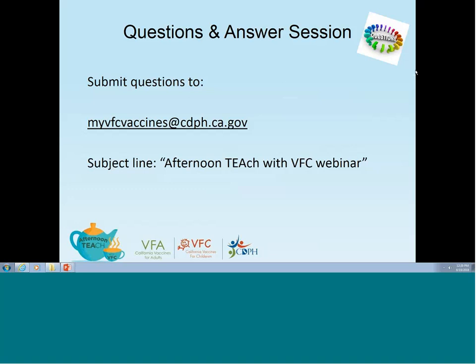When you submit your report, if it is a non-excursion and they tell you thank you for documenting, it will display on the results and instructions page. If you are instructed to contact the vaccine manufacturers, the SHOT ID will display on the thank you page when you've submitted your report. Thank you.